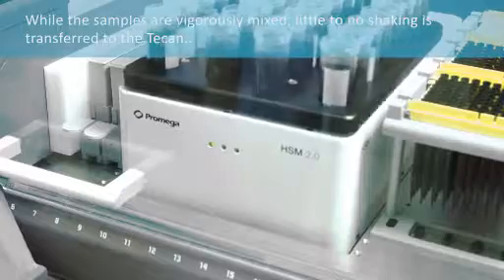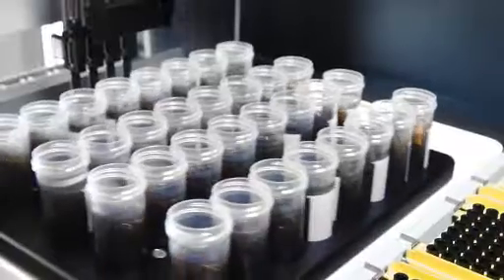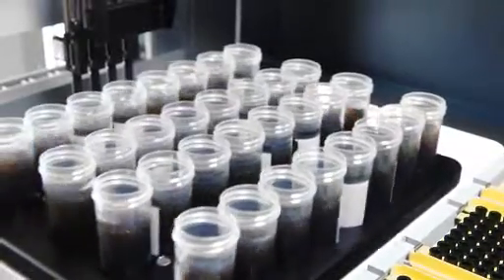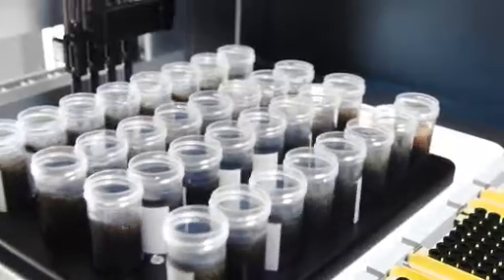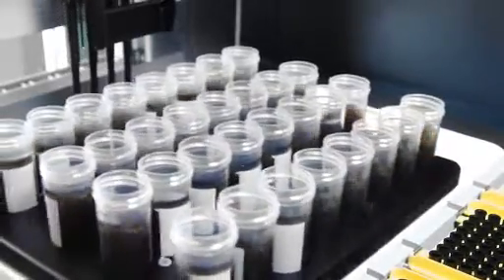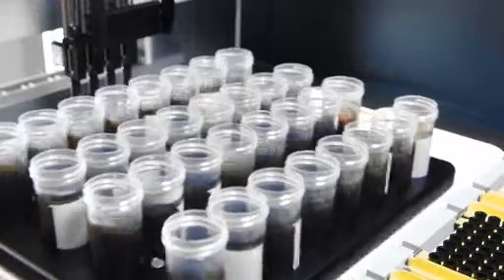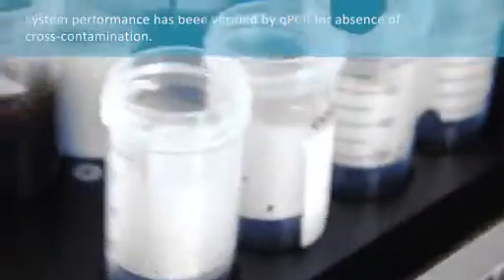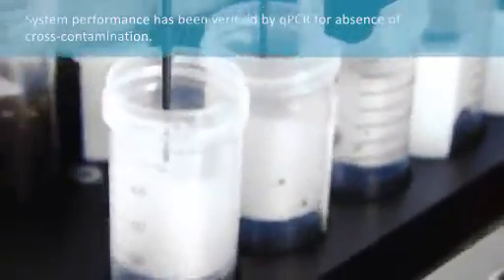This example is a full HSM with 32 10-milliliter samples. The protocols are optimized to eliminate cross-contamination and system performance has been verified by processing checkerboard arrays of samples and downstream testing by qPCR.